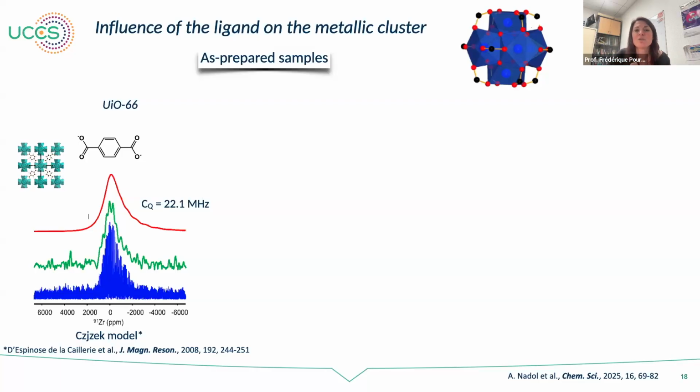With oxygen-17 it's much easier to do a D-HMQC because you don't have to do the spin lock for the quadrupolar nucleus, and the quadrupolar nucleus doesn't want to stay locked. So it's usually easier to do D-HMQC.